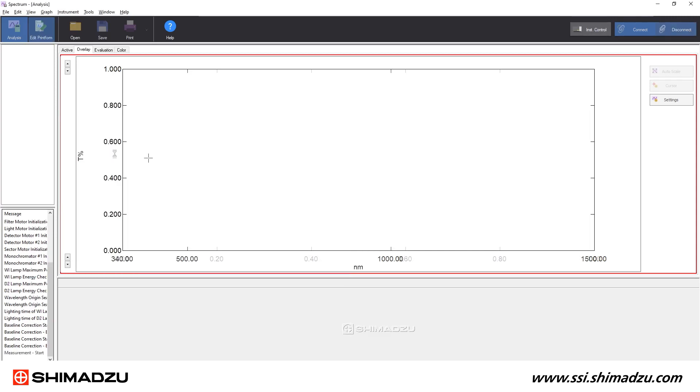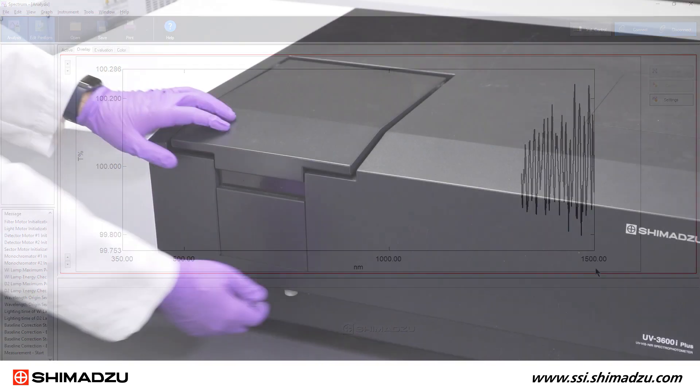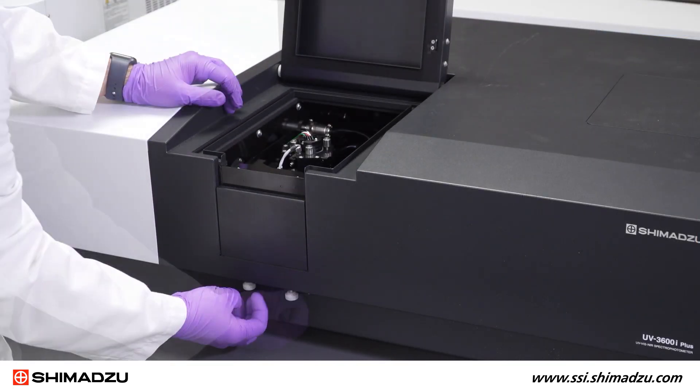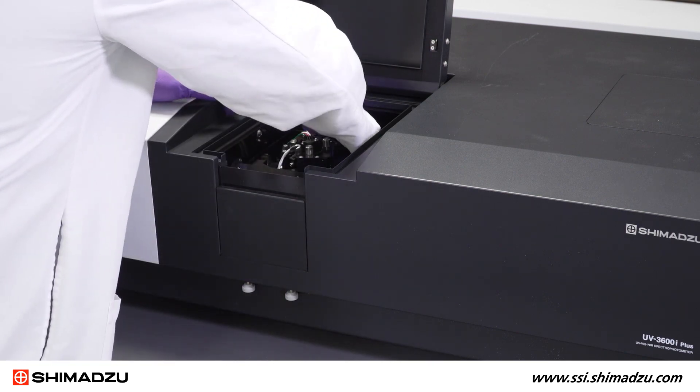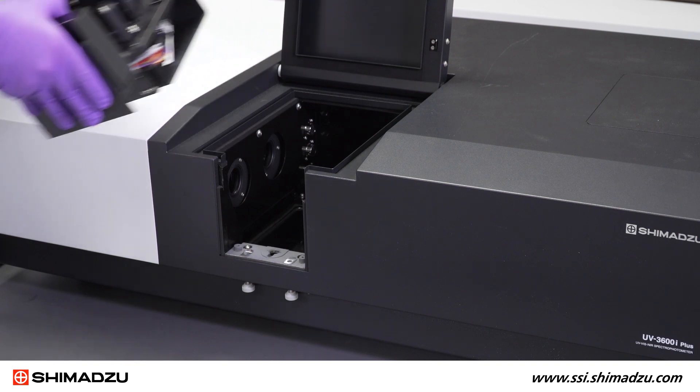The spectrum data will appear on screen while your sample is being measured. Once your samples are finished, you can remove the integrating sphere and reinstall the cuvette holder.